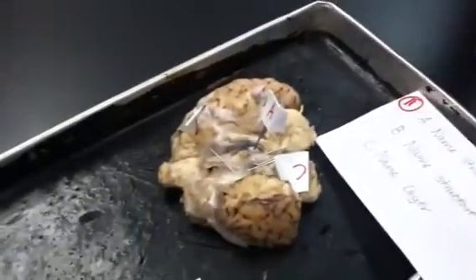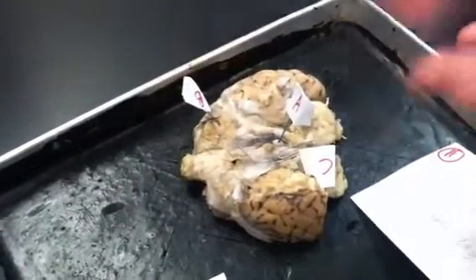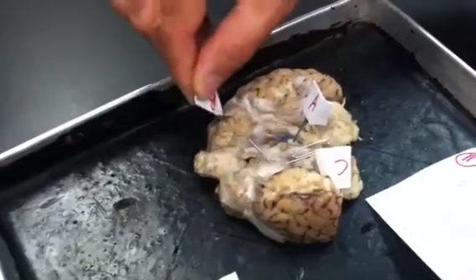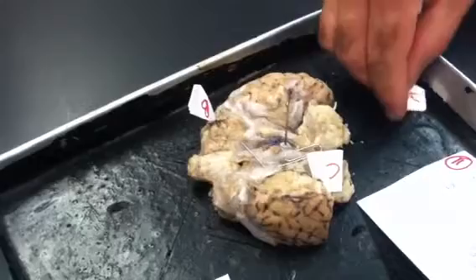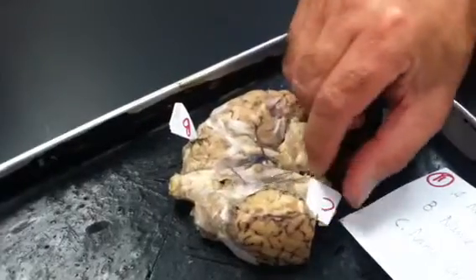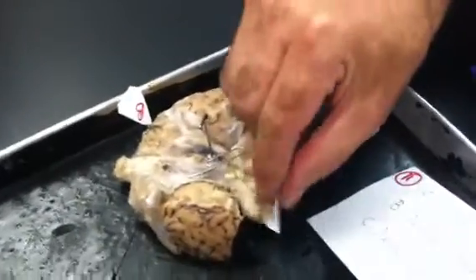So here we have a sheep brain. One of the things I can do is ask questions to see if you know the structure. So what is this right here? The cerebellum. Excellent. This is from the practicum. So this is the what? Starts with a P. The pituitary. I have no idea what this is. That's the dura. It's the dura mater.